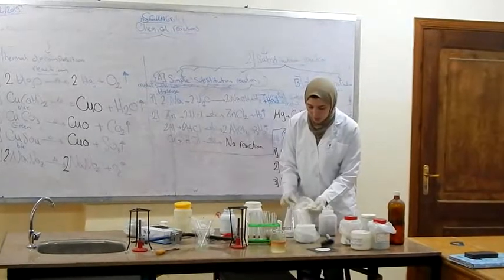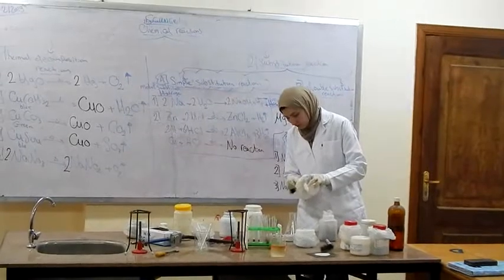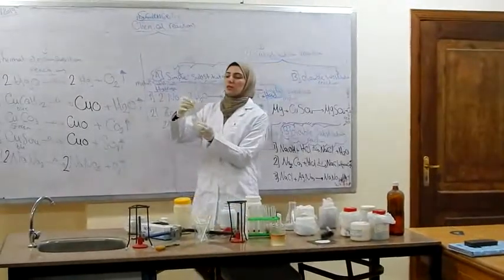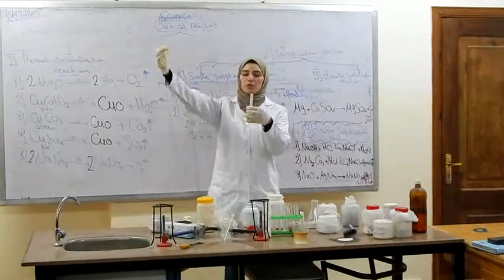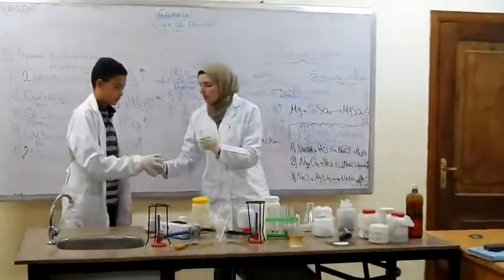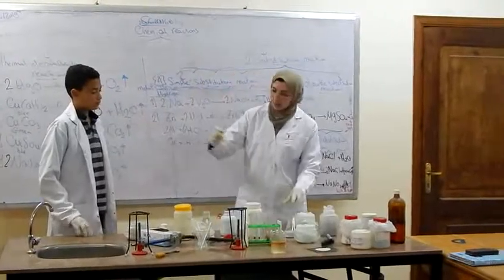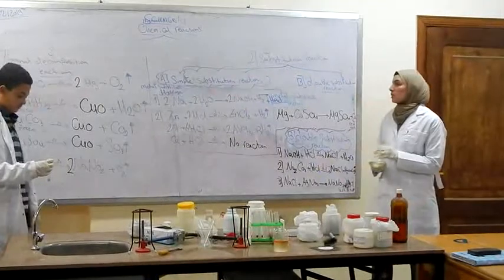This is solid sodium hydroxide. We put some water to prepare sodium hydroxide solution, which reacts with this. The first double substitution.